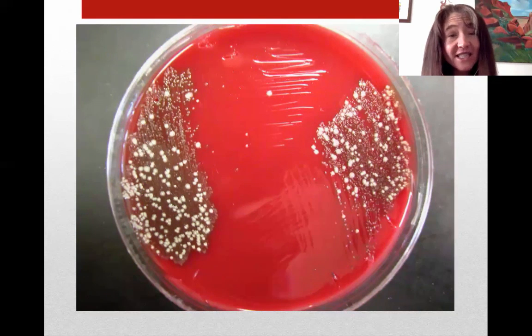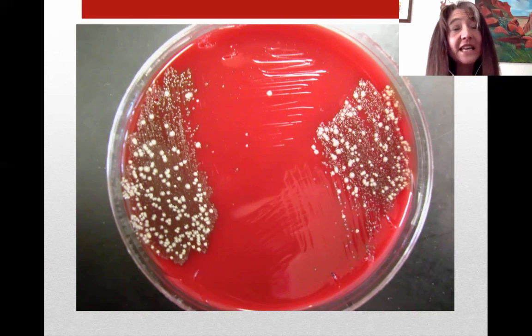What would be disgusting is if you saw a monoculture in your throat. That is, if you saw only one bacterium and it was all beta hemolytic, then you would be like, oh no, I have a disease, right? There's a lack of biodiversity, and this particular microorganism is lysing the heck out of red blood cells. So it would be indicative that you had strep throat. These throat swabs are from students who have normal flora in their throats. Their microbiome looks very healthy in their nasopharyngeal area.